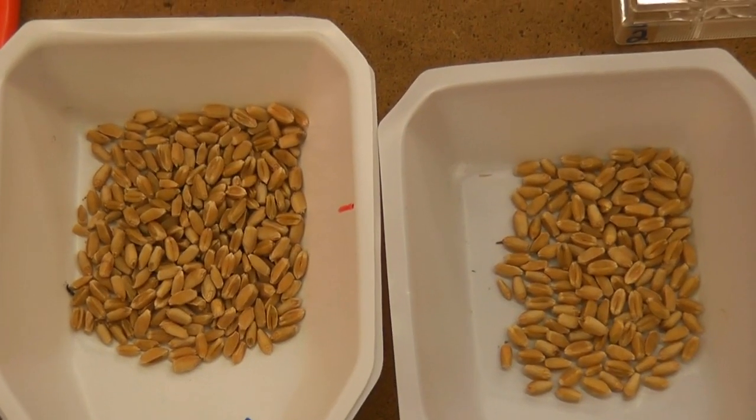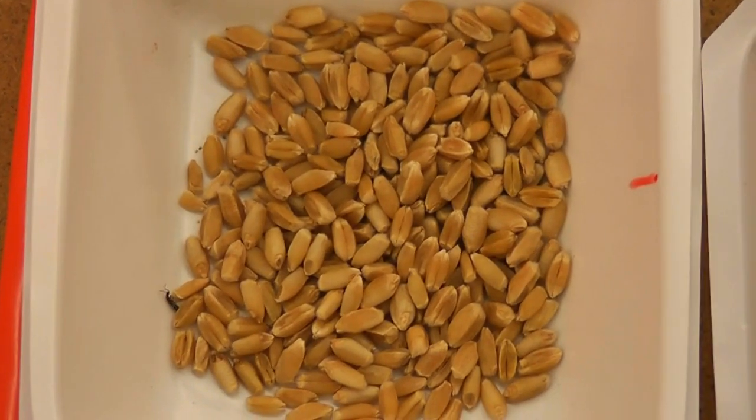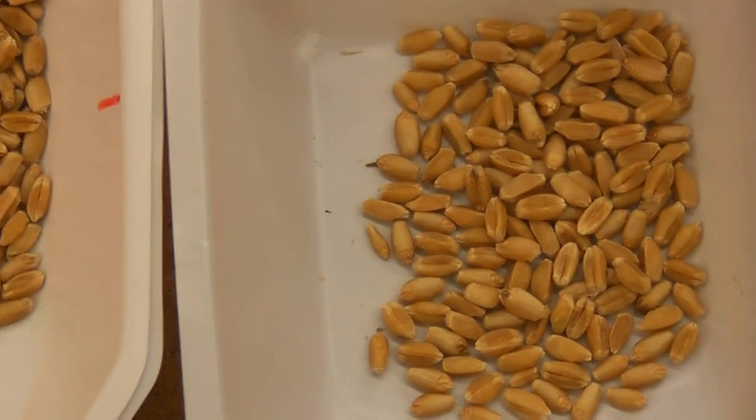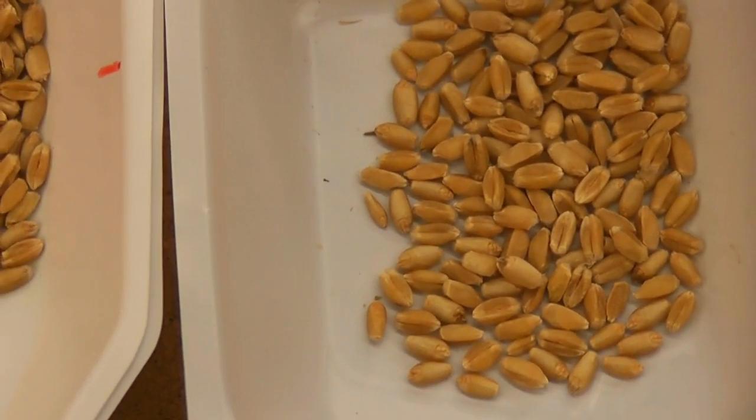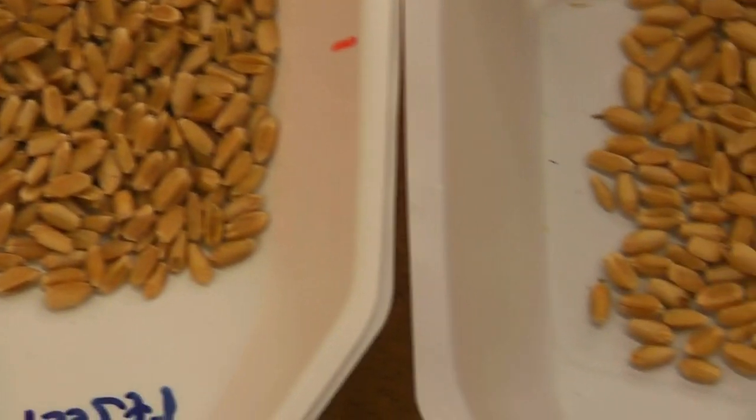Okay. So there's some of the sorted kernels. There's the more narrow kernels right there. And there's our more roundish kernels there. They're all from the same wheat variety, this white wheat.